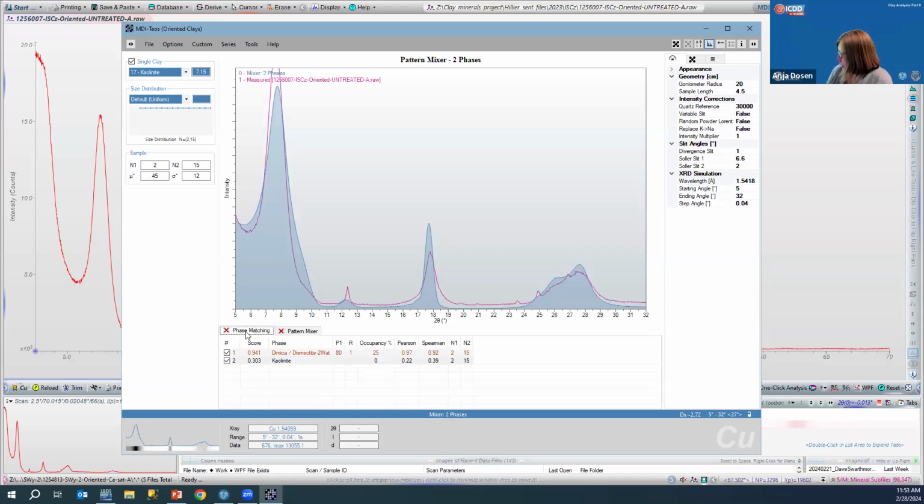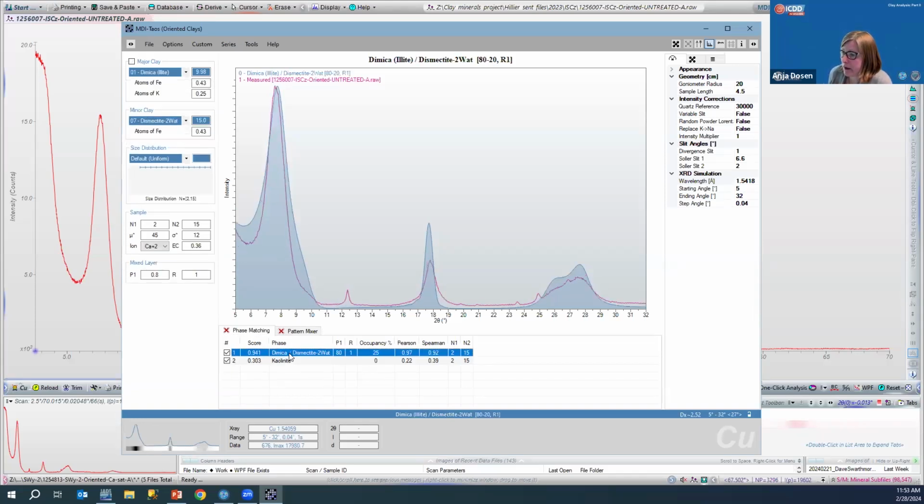So now, if I go back here and I right click and say create GA set, I can do this through the tools tab as well. This is something that's called a genetic algorithm.